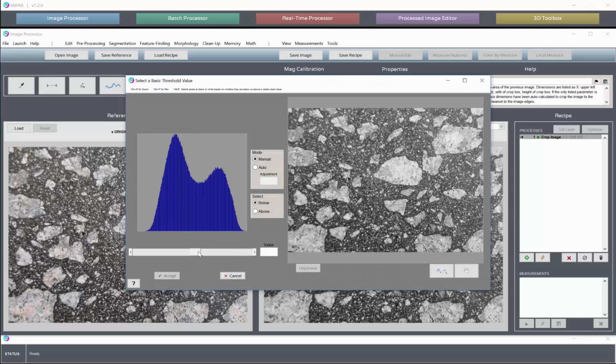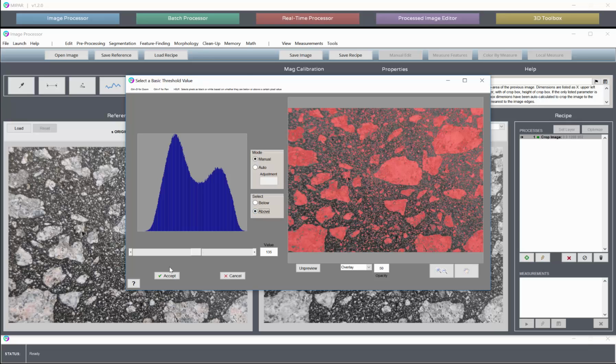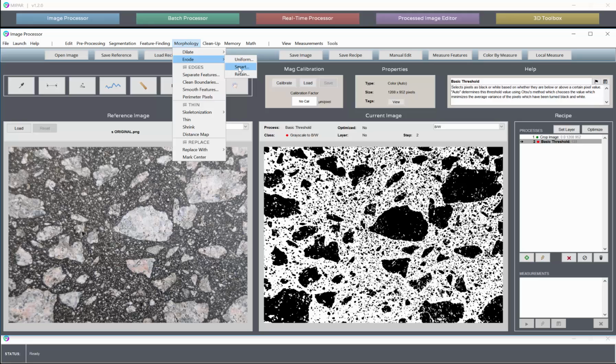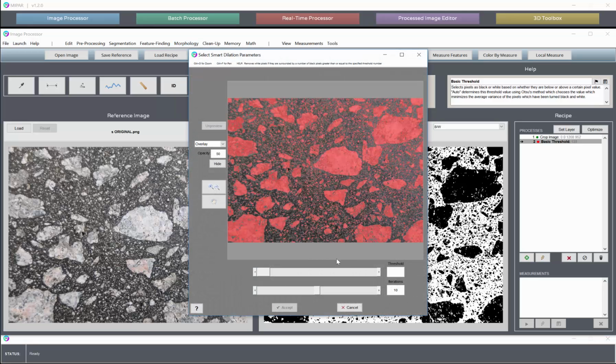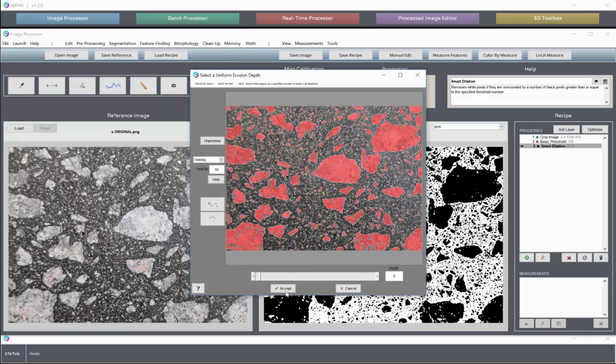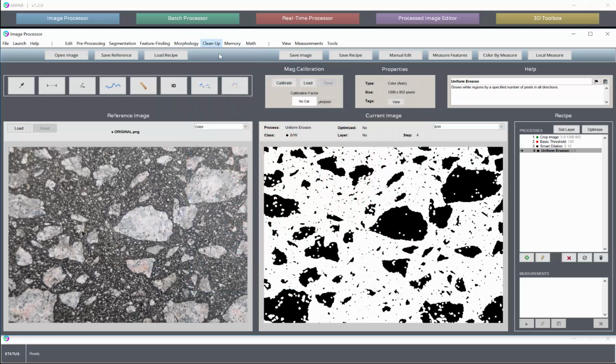here to find all of the larger features. So we did something like this, and we had a cleanup operation here. And then we shrunk everything down a bit, and we rejected small features.